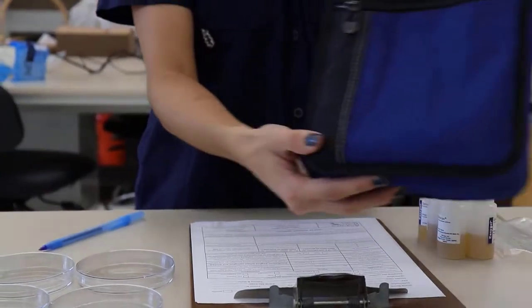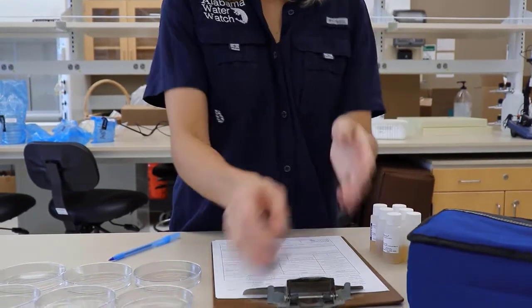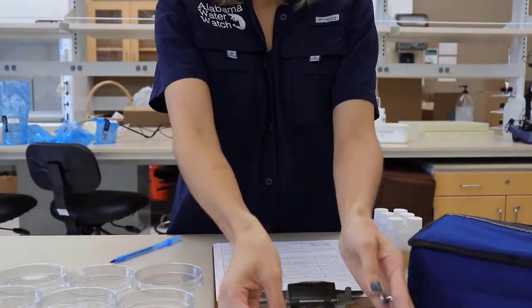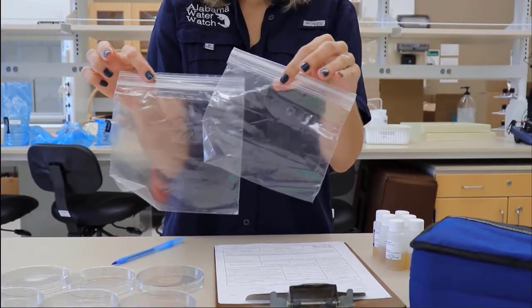You will need a small cooler or Ziploc bag to transport your samples from the field along with an ice pack or a bag of ice to keep your samples cool. We suggest that you put the media bottles in Ziploc sandwich bags, 1 bag per site you will test. This will help you stay more organized and prevent you from mixing up samples from different sites.